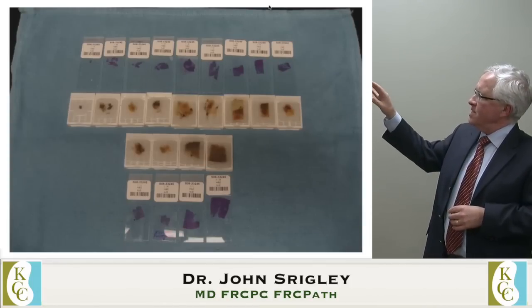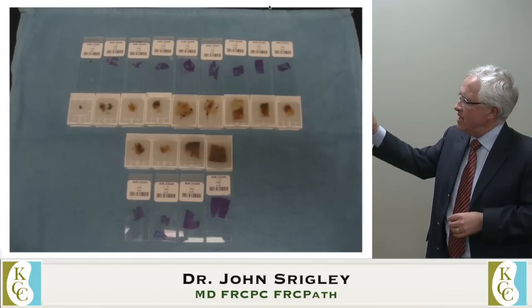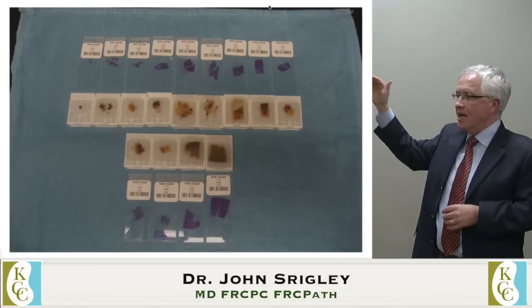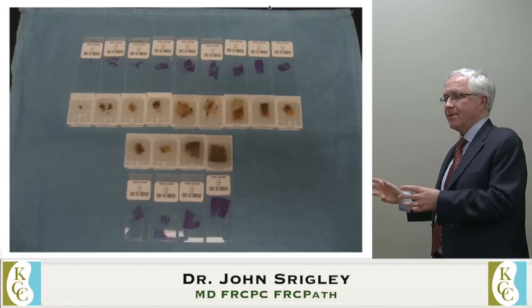So at this point here, we see that we have the tissue's been processed, we have the blocks, and we have the slides that have been produced from those blocks. Now they're ready to go to the pathologist for examination.